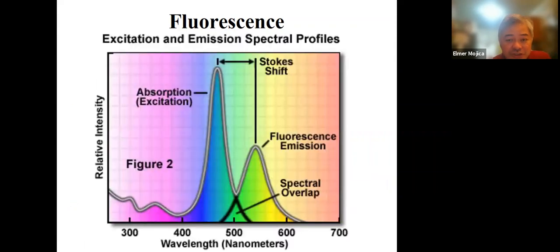And if you're going to show here, I'm going to show you the so-called mirror image thing at yung tinatawag nating Stokes shift. So this is an excitation and emission profile. So the excitation is just similar to the absorption that we discussed. Now, the emission is just the mirror image of that. Now, sometimes the Stokes shift is affected. How is it going to be affected? It can become wider or narrower, depending on the system.